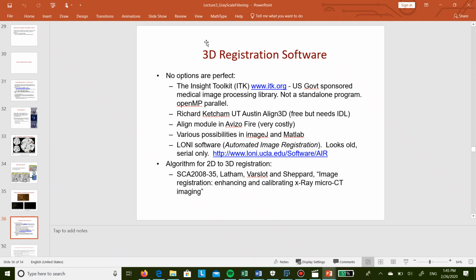There is registration software. This is somewhat outdated, I have to say; this is from 2-3 years ago. There was not much on registration that was very good, other than software that calculates cross correlation. So I probably have to redo this search and see whether some magical plugins have reappeared in the meantime. For instance, non-local means denoising appeared only in 2016 or 2017 or something like that. So relatively recent. Things are rapidly evolving in this world.